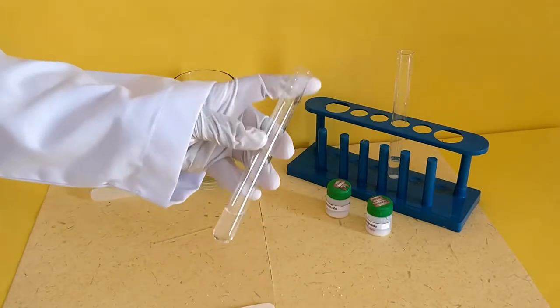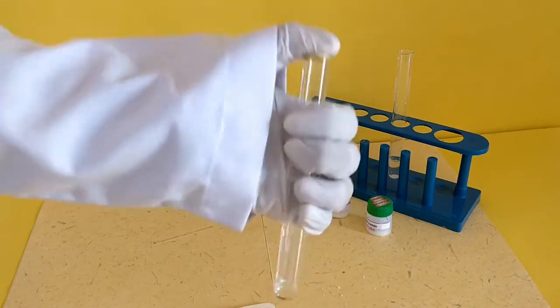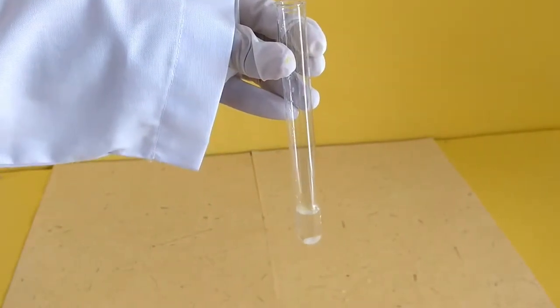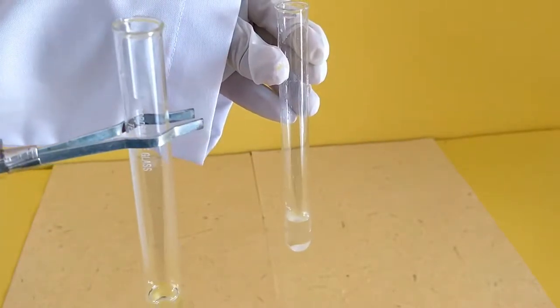Similarly, prepare an aqueous solution of potassium iodide in a separate test tube. Add the aqueous solution of potassium iodide to the aqueous solution of lead nitrate.